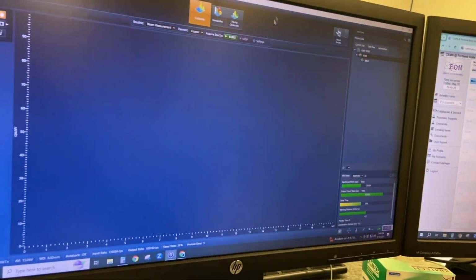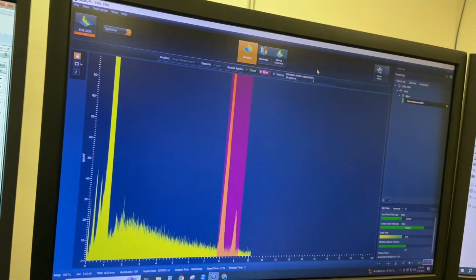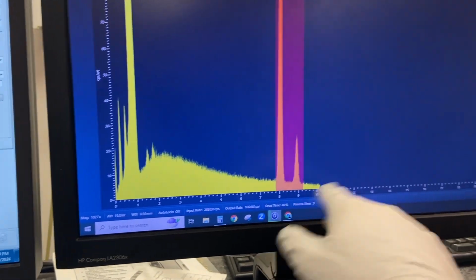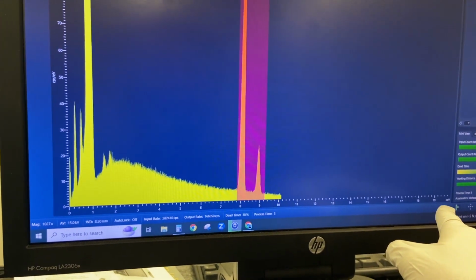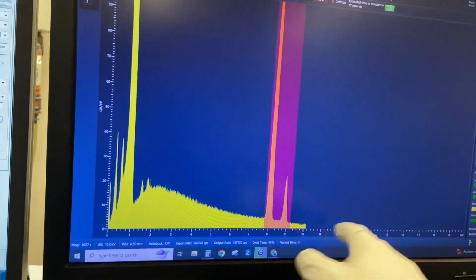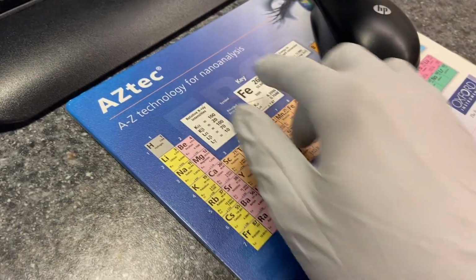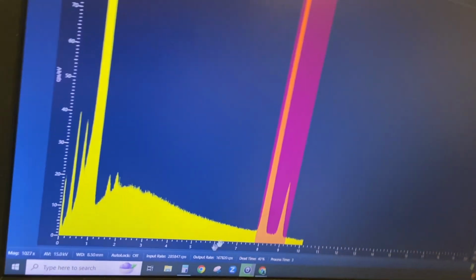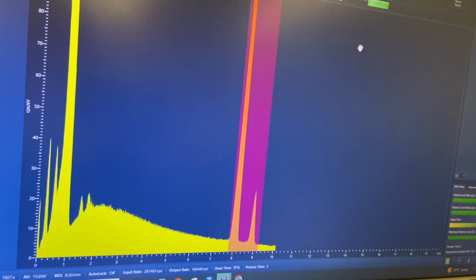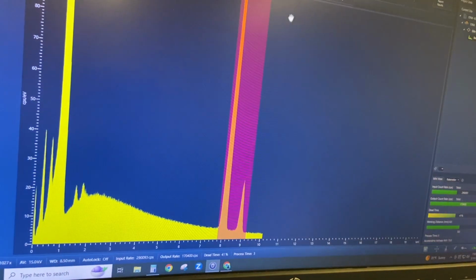Okay, and now for the first time, we're actually going to use this computer, and we're going to do our beam measurement on copper, and 5 million counts. Let's go. All right, there we go. So this is our energy spectrum here. This is in keV, or kilo electron volts, and these are energy peaks, or first excitation peaks for specific elements. That's what one of these two things can essentially tell you. And copper's K alpha peak is here, and K beta peak is there. That's essentially where you want to see that beam measurement lined up perfectly. That's good. Measurement's okay. Let's run another one.